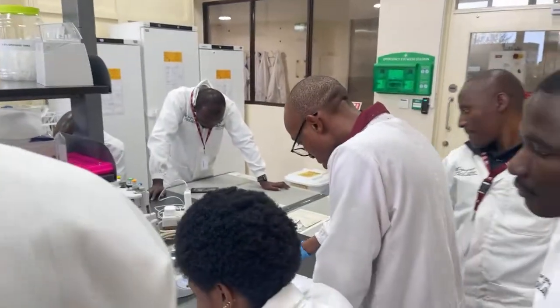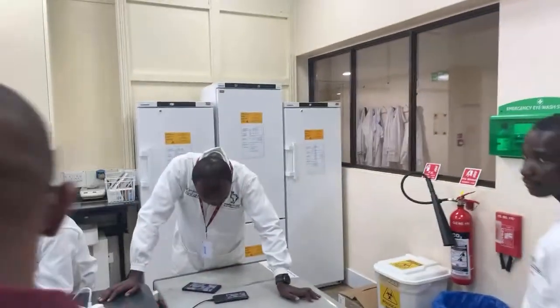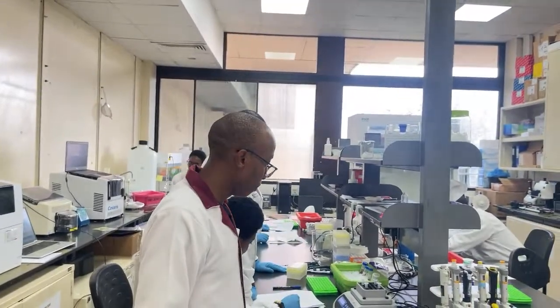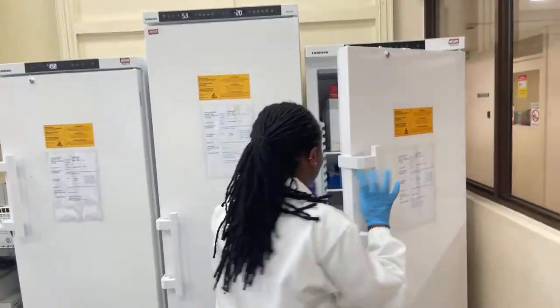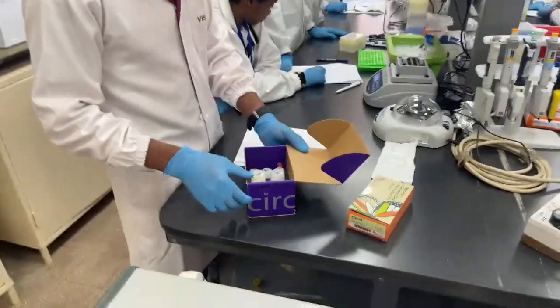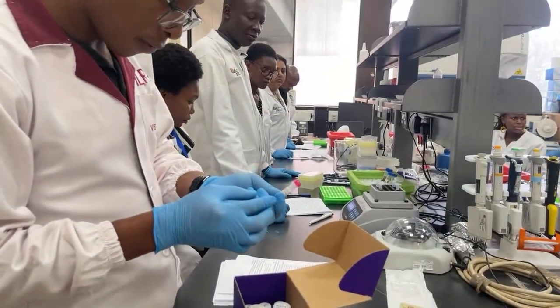Okay, let me see, what's the next step? Short spin again, that's the SB, buffer SB. So where's the kit? Nanobind. Purple one. It's in there. Yeah, there you go. Buffer SB.